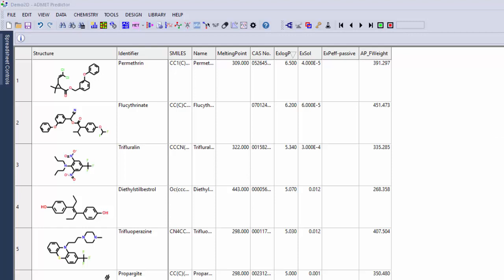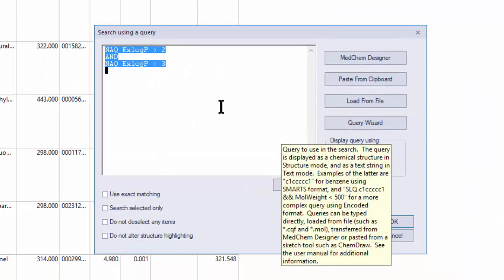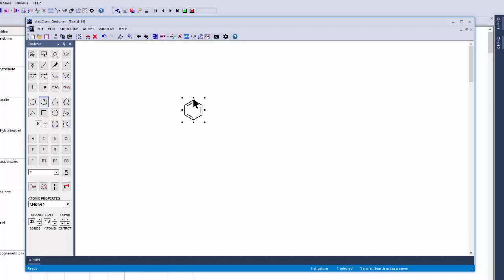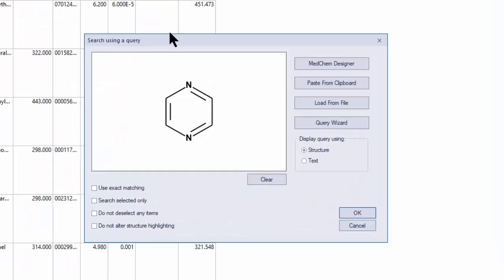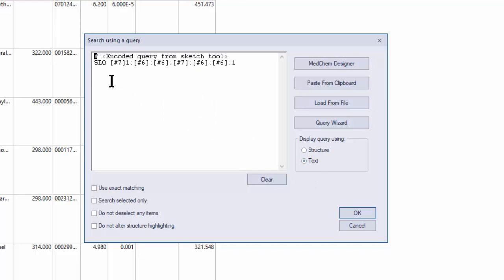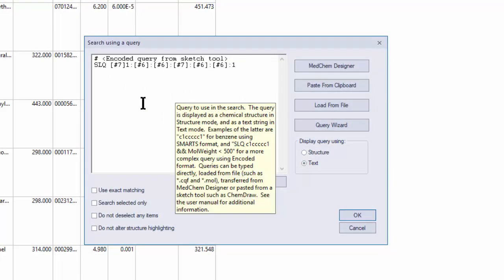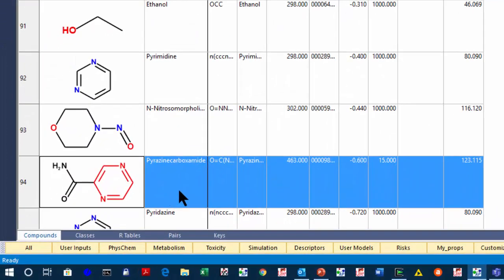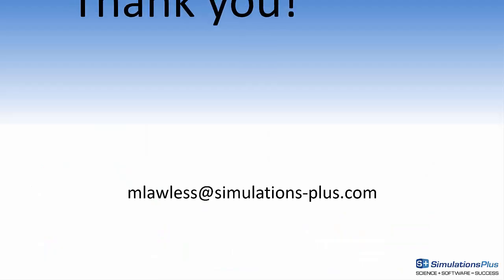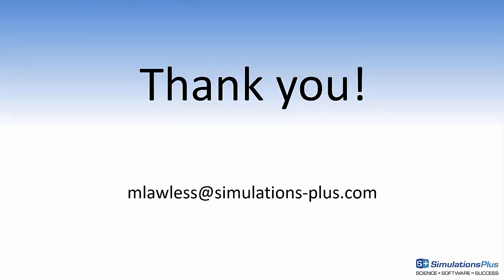Finally, I want to show how you can use the query wizard to do a substructure search. When you hit Control-Q, it brings up this dialog box. Click on MedChem Designer to bring it up, and then I'm going to search for a simple pyrazine ring. I would enter the query, then transfer it back. It shows you a picture of the query. If you hit the text button, it shows the SMARTS string that it's executing to find these compounds, and you could edit this if you wanted to. I'll click OK, and it highlights just a single compound. You also notice that it highlights the substructure in red. Thank you very much for watching this video. If you have any questions, please send me an email at mlawless at simulations-plus.com. Have a nice day.